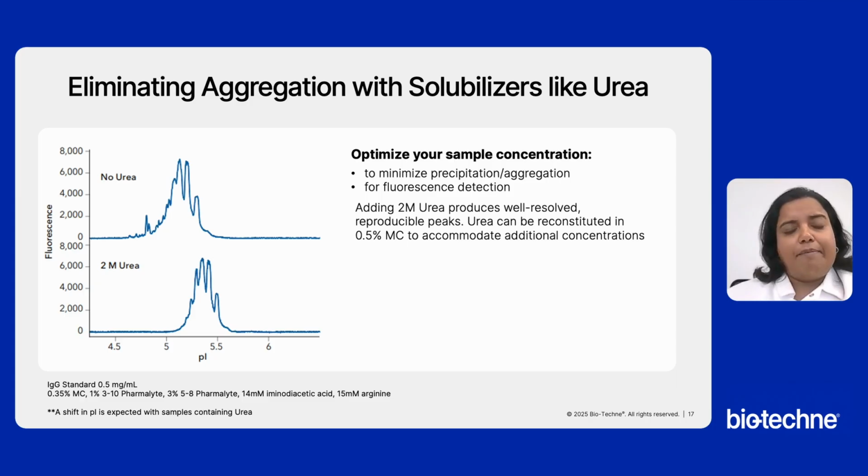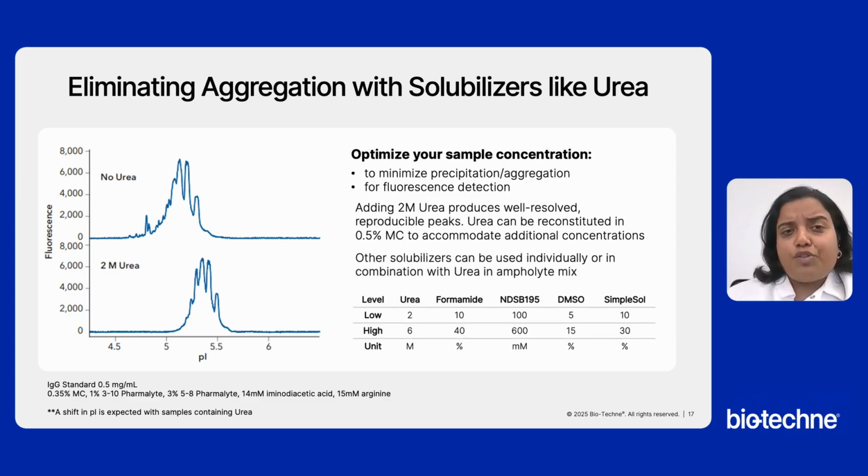When optimizing the sample concentration to verify the peak profile, it's important to avoid artifacts caused by signal saturation. Signal saturation can be identified by peak shapes that flatten near their maxima and may distort the peak profile or reduce resolution between the peaks. Peak intensity should be below 60,000 fluorescence units to avoid signal saturation. While MauriceFlex batches are not meant for assessing peak quantitation or resolution, the number of peaks should be comparable to those seen on a Maurice icIEF batch used for the same molecules.